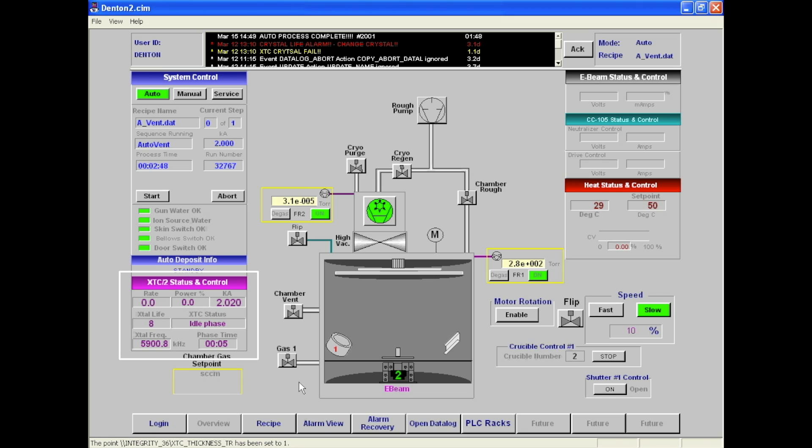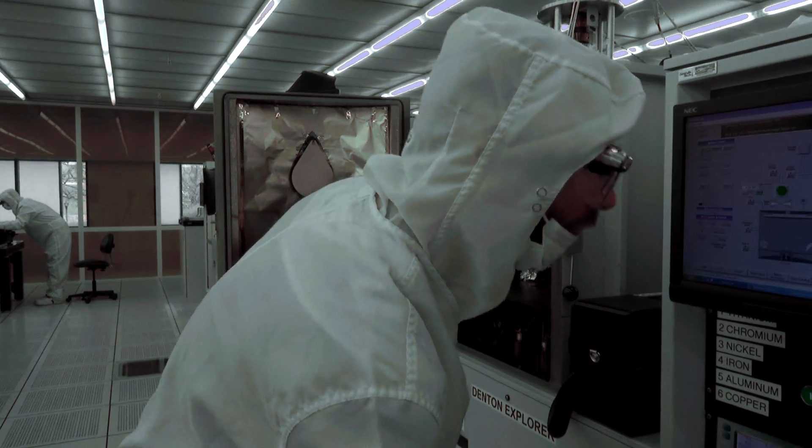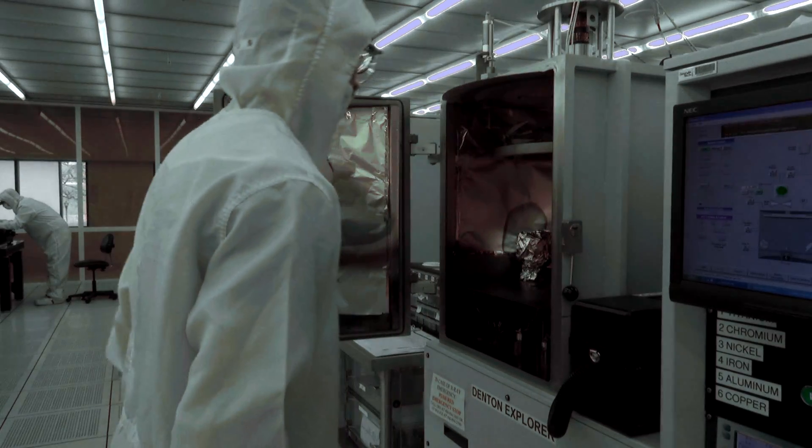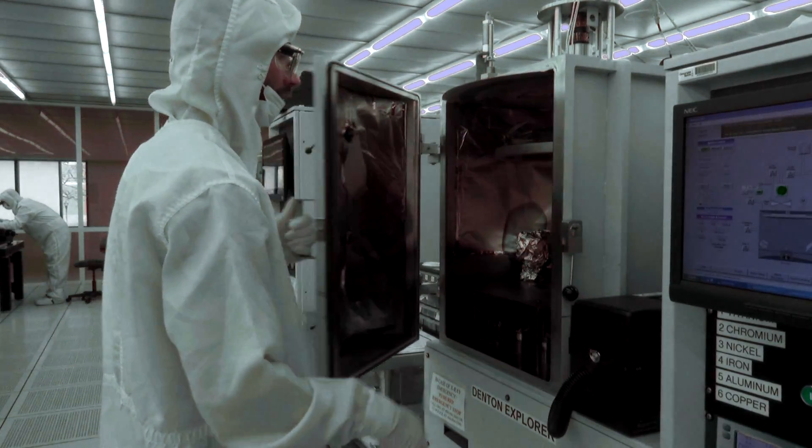If the crystal life is greater than or equal to 15, you will need to replace the crystal sensor. Once you have checked on the crystal sensor, close the chamber door and secure it with the lever.